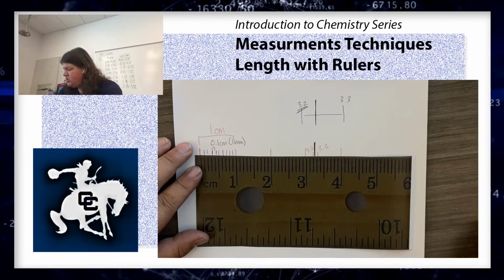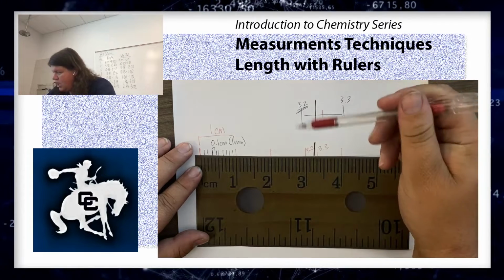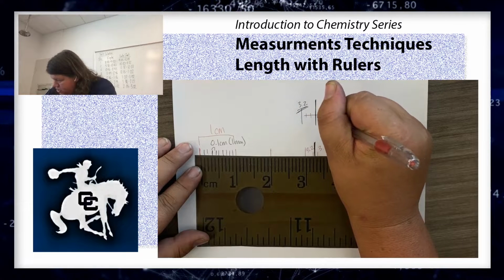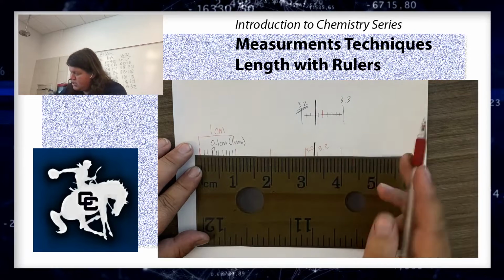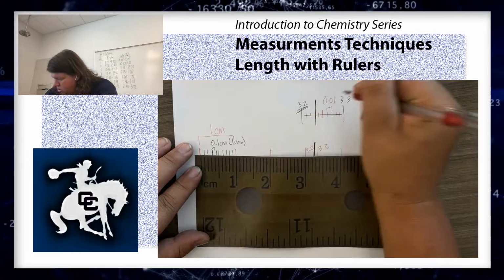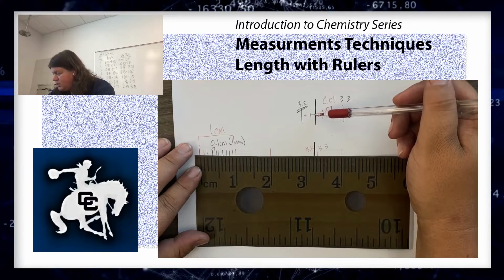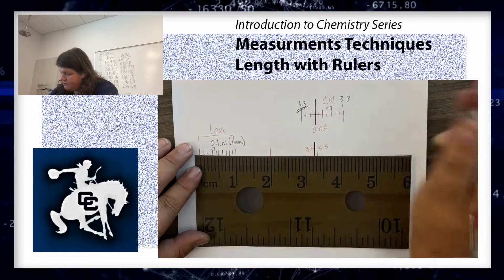Now, visually speaking, I split this thing up in half right here. I will notice that there are an equal number on each side, and then I will visually break it apart into even smaller chunks, like you see here. There should be 10 lines between these. Each of these represents 0.01 of a measurement. So here it's pretty obvious that this line is very, very close to this line right here. This would be 0.03.